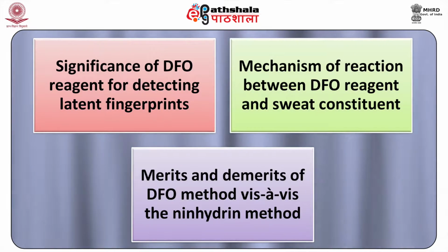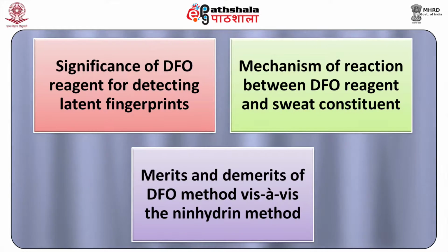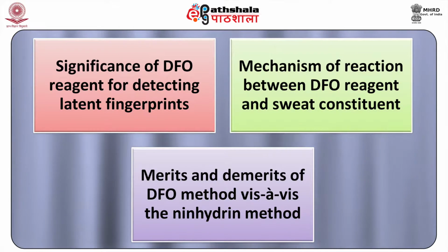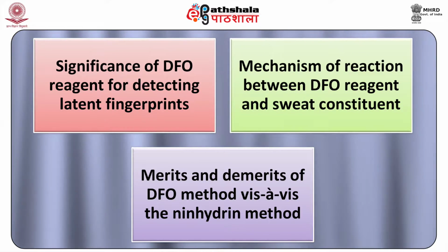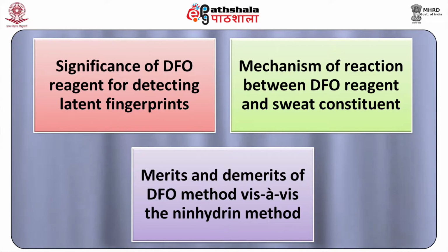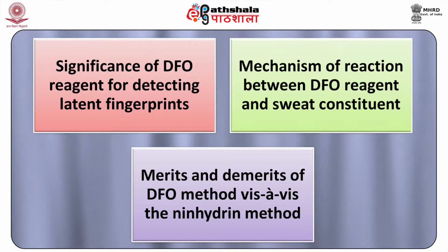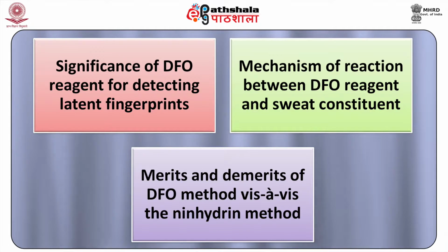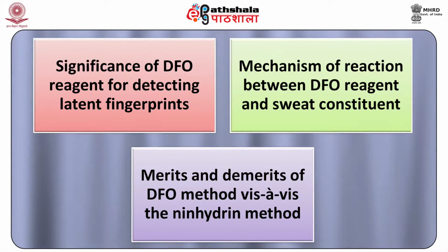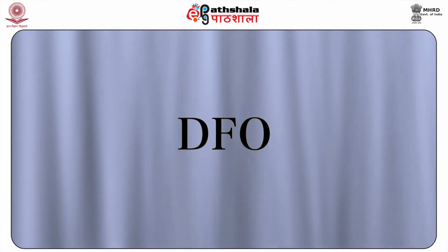Dear students, after studying this module, you shall be able to know the significance of DFO reagent for detecting latent fingerprints, the mechanism of reaction between DFO reagent and sweat constituent, and will come to understand the merits and demerits of DFO method vis-a-vis the Ninhydrin method. So let us start with a brief introduction of DFO.